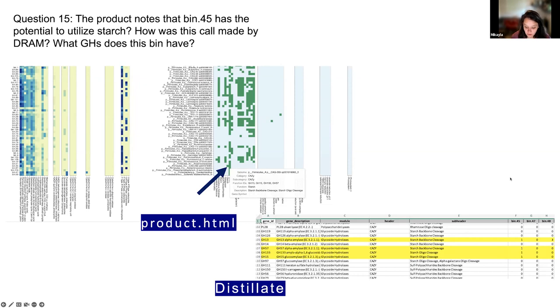You could go a step further and say, pull all of those with the strainer that Rory mentioned. So you can get the sequences. Or you can say, I want to know all the gene neighborhoods of GH13, or some of these co-located on the genome. And so with some of the newer tools that are now functional in DRAM, we can start to get some of these answers. And it's really because all of them are linked, all of the files out of DRAM. Then the next one.